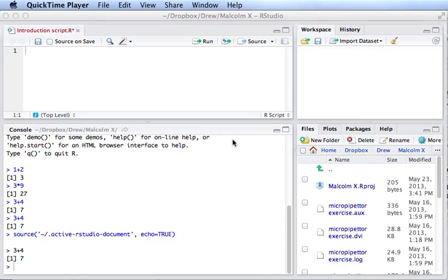So now that you've got the basics of how to set up RStudio, we're ready to use it to start analyzing our data. So the first task we have is we have our data. I'm assuming that you have your data that you've recorded from a fluorimeter. We're going to be working with the calibration data. So this is not enzyme activity data. This is just how the fluorimeter responds to different concentrations of fluorophore.